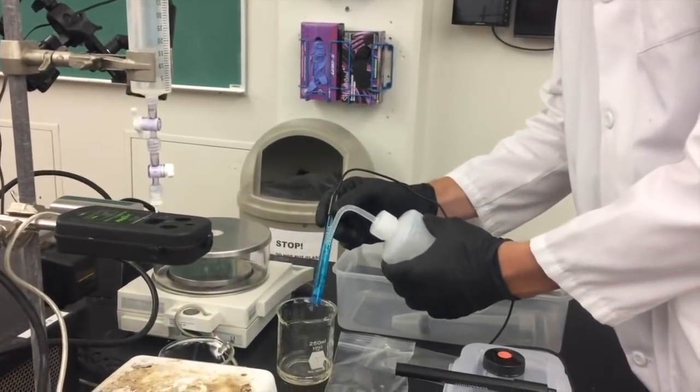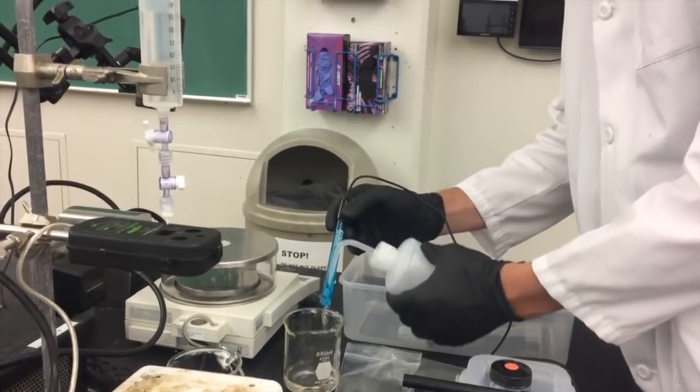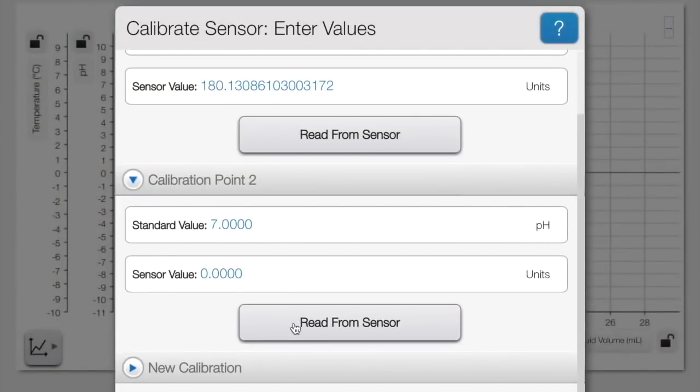Rinse the sensor again with distilled water and then repeat the process with the pH 7 buffer solution. Now your pH meter should be calibrated.